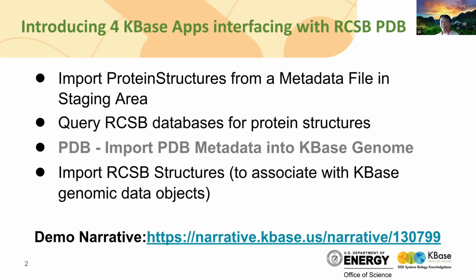So here are the 4 apps that we have developed for this specific course and also for this purpose. The first one is we want to import. We already have a data type in KBase set up. We named it protein structures. It's a data type or data object, as Chris said.